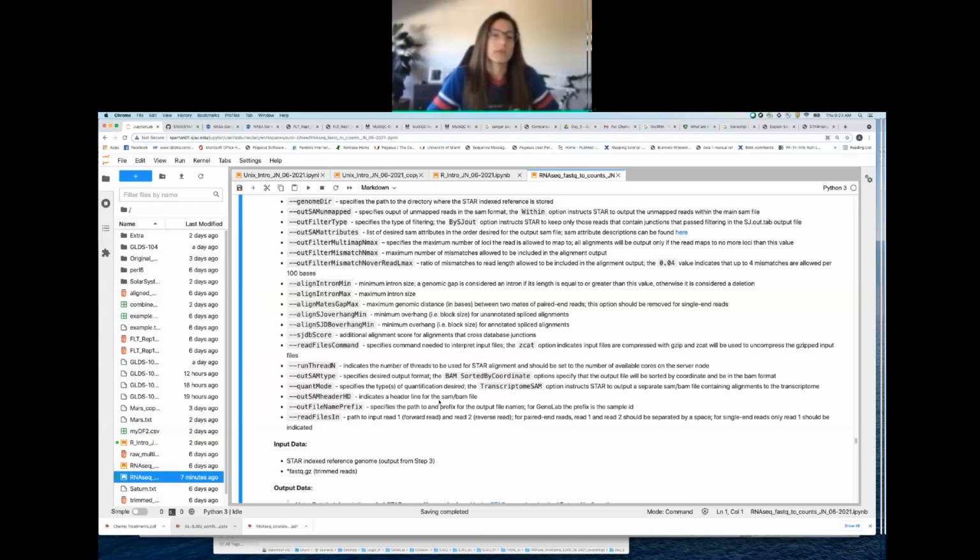There are some tools that do counting that will look at the align to coordinates, but they'll also have to figure out which ones were transcripts of those genomic coordinates to be able to do the differential gene expression, especially if you're identifying splice isoforms. Genes can have multiple transcripts, each transcript being a different splice isoform. So to get more information from that differential gene expression, we use the align to transcriptome mapped file. Does that make sense? Awesome.